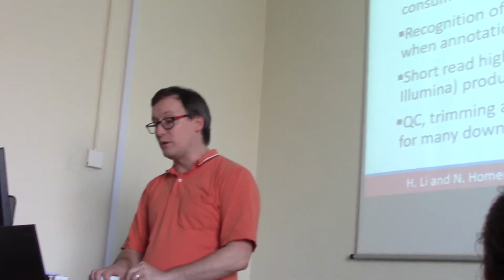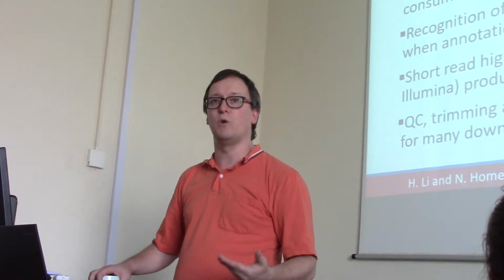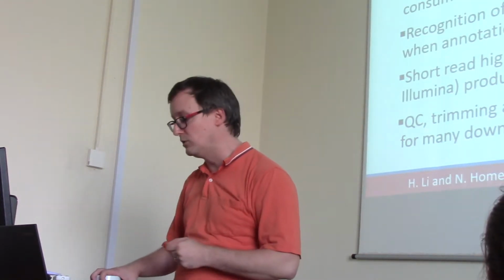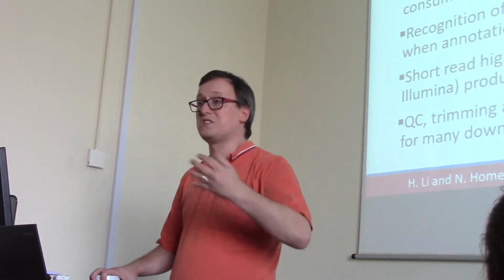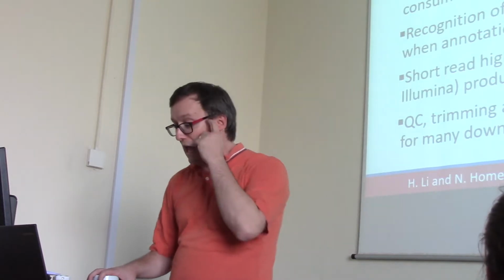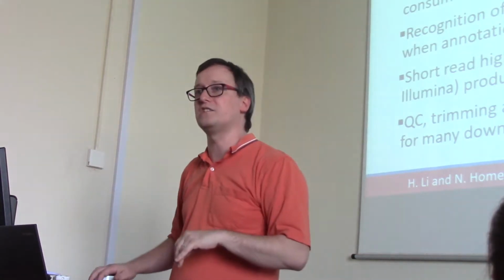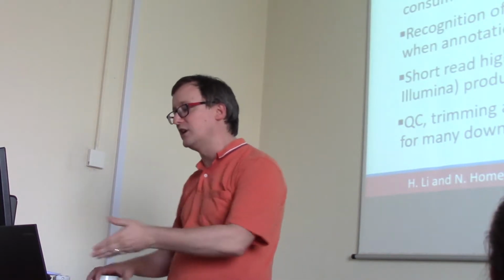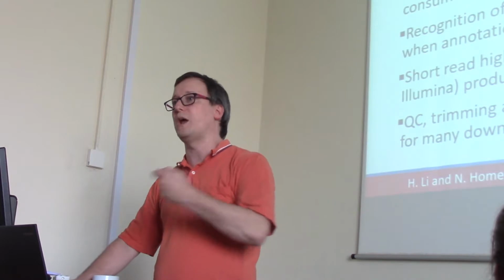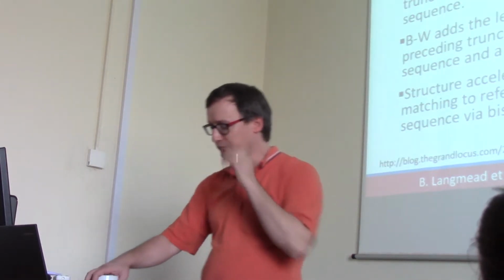And also, it's quite important that we understand that all the downstream stuff we want to do, like doing variant calling to produce variant call files, for example, is going to assume that you've been able to do this alignment already. So having a QC step, having some sort of trimming to get the nonsense away from these sequences, and having an alignment to a reference annotation is just part of the game. It's what you have to do in order to get to the next stage of data analysis.